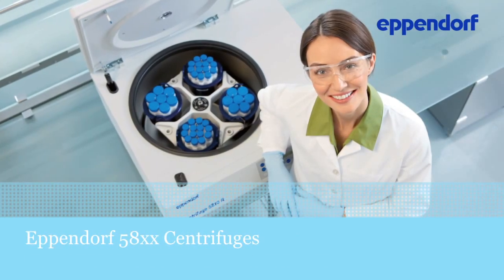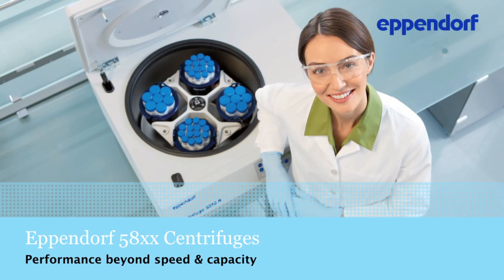Eppendorf Multi-Purpose Centrifuges. Performance beyond speed and capacity.